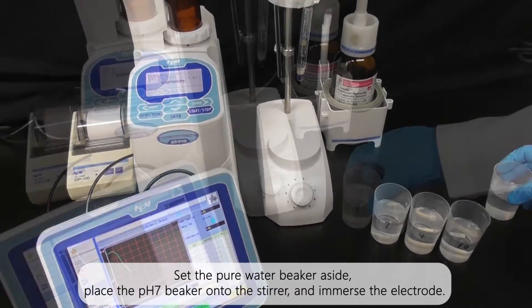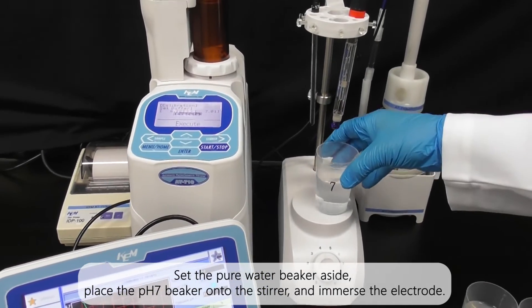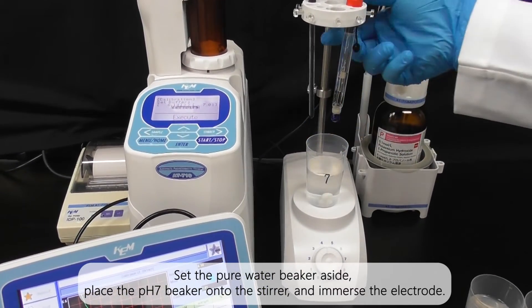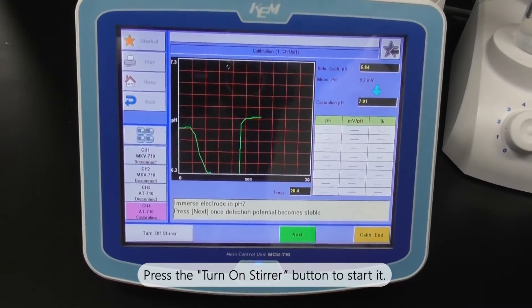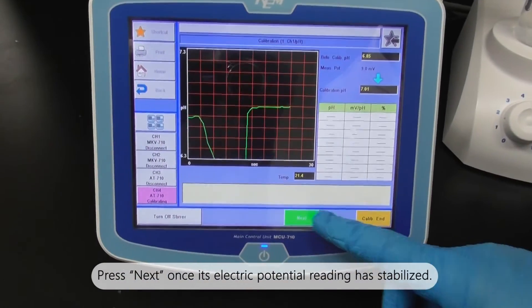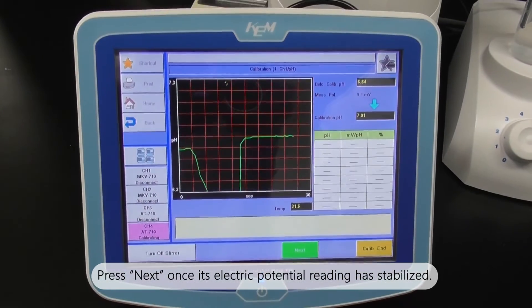Raise the electrode and wipe its tip lightly to remove moisture. Set the pure water beaker aside. Place the pH 7 beaker onto the stirrer and immerse the electrode. Press the turn on stirrer button to start it. Press next once its electric potential reading has stabilized.